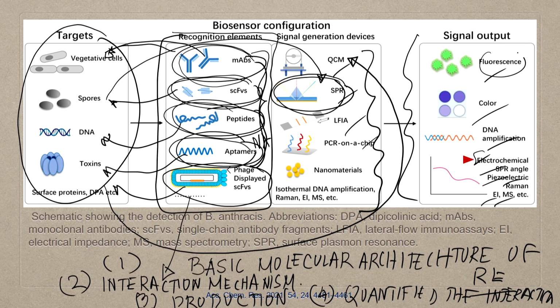You can understand without using any label, because when we are talking about using a label, we are talking about some kind of a fluorescent probe, we are talking about colors, we are talking about DNA amplification. Of course, electrochemistry is much more of a label-free system, but any system where there is charge transport involved, where there is an alteration of charge moieties, say electrons or protons or some other charge moieties, and if you could detect them, they give you lesser noise.